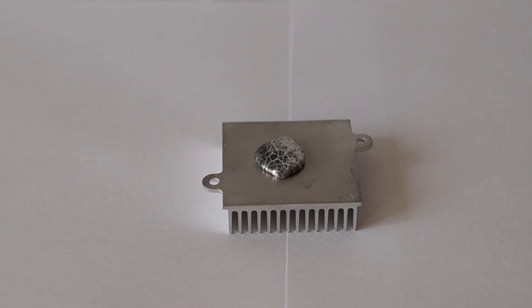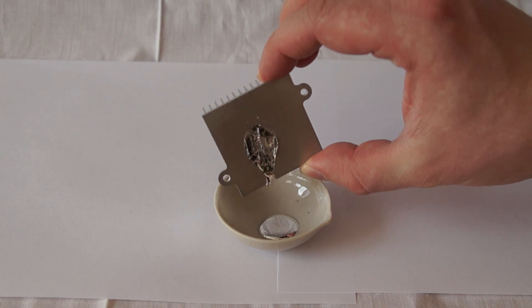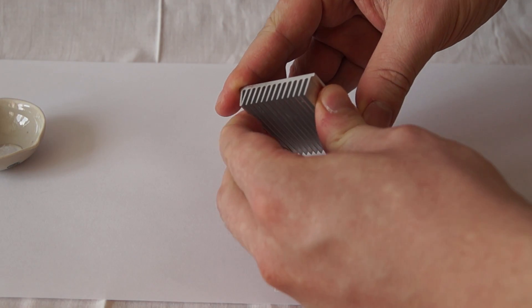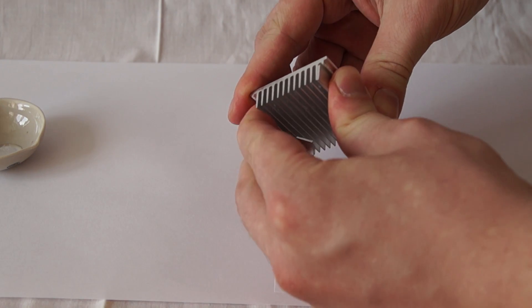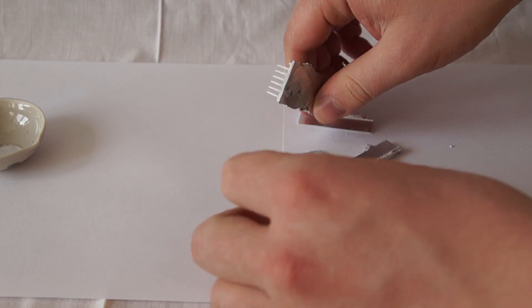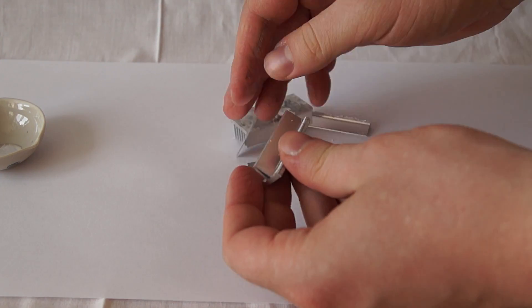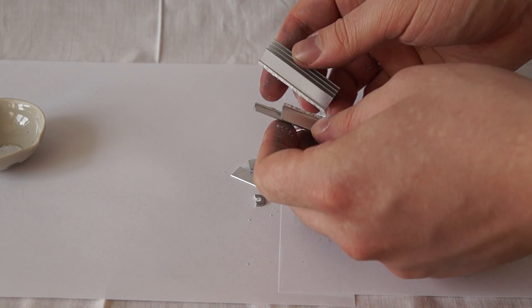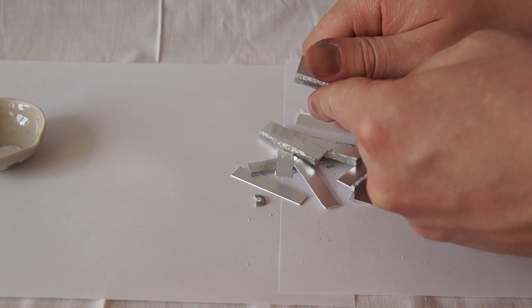After two days we need to wash the unreacted residues of gallium from the aluminum. Now let's check the fragility of the aluminum radiator. As you can see with a little effort aluminum easily starts to break in my hands. If I had left the radiator impregnated with gallium even longer, it would have become even more fragile.